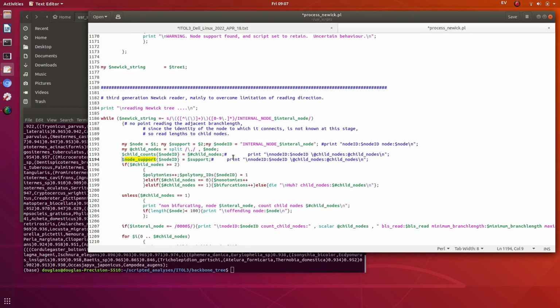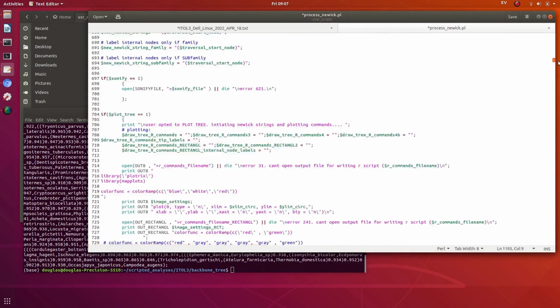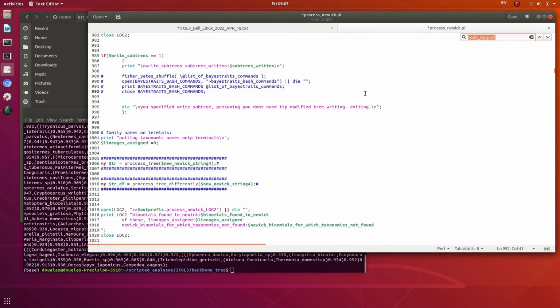from this hash here. So I'll copy that and try and go back to find where we were before. Let's plot.